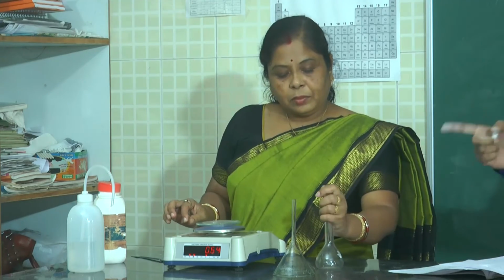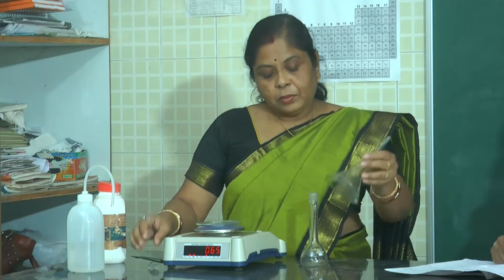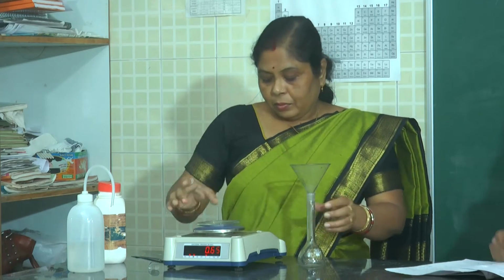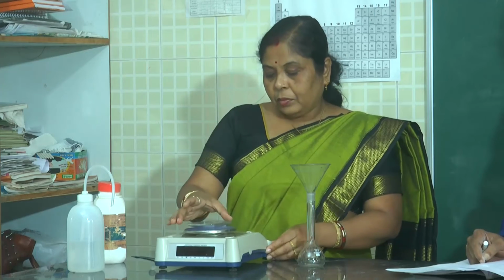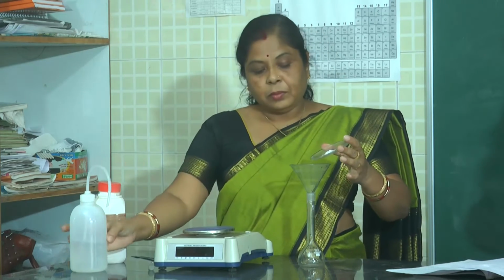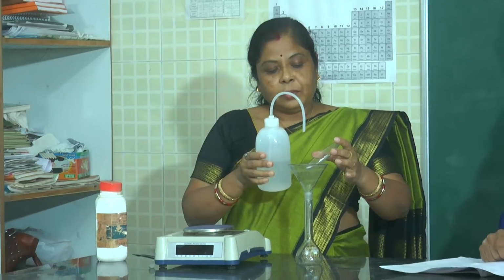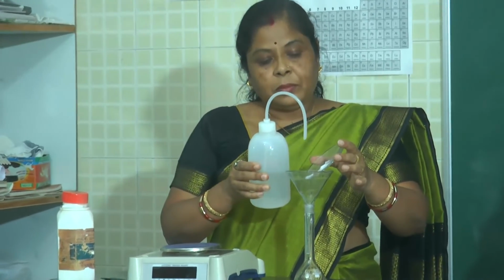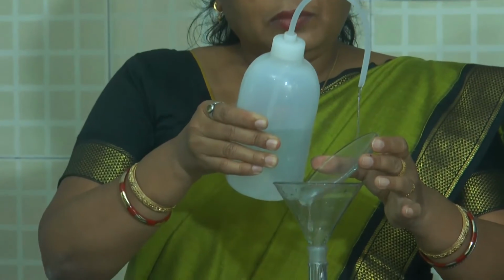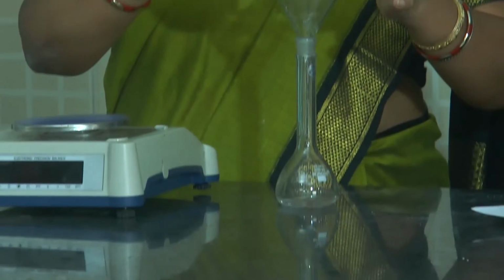Let us see how to transfer it. That is also important, how to transfer it to the measuring flask. You take a funnel, a wide mouth funnel, then it has to be transferred quantitatively. Remember, quantitatively. Not a single molecule should be taken outside or spilt outside. So very cautiously you have to transfer the whole quantity of the oxalic acid to the measuring flask.